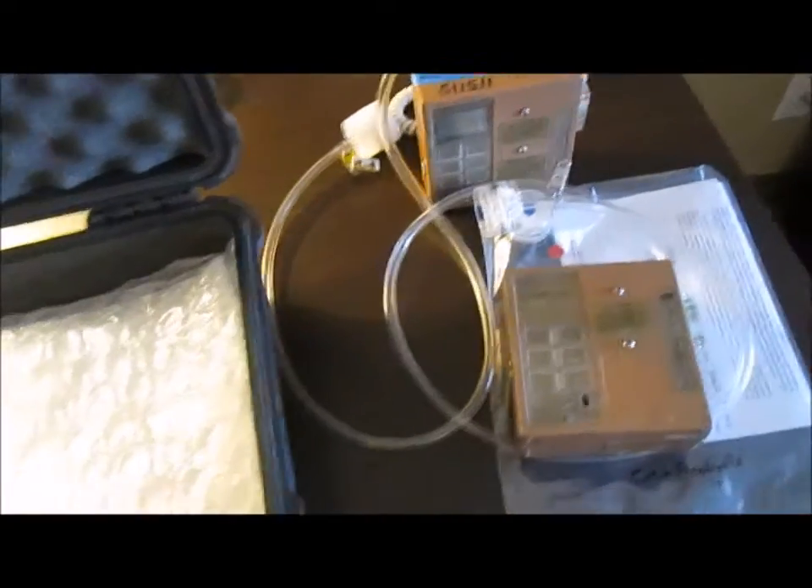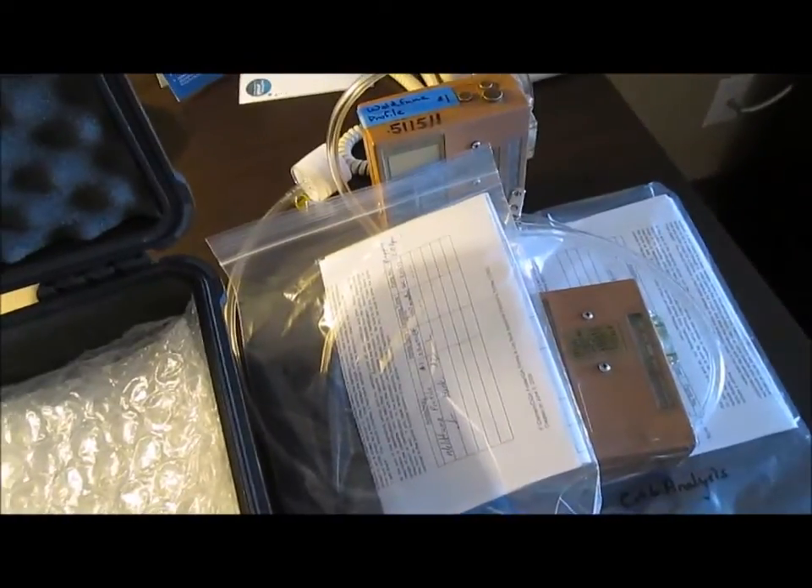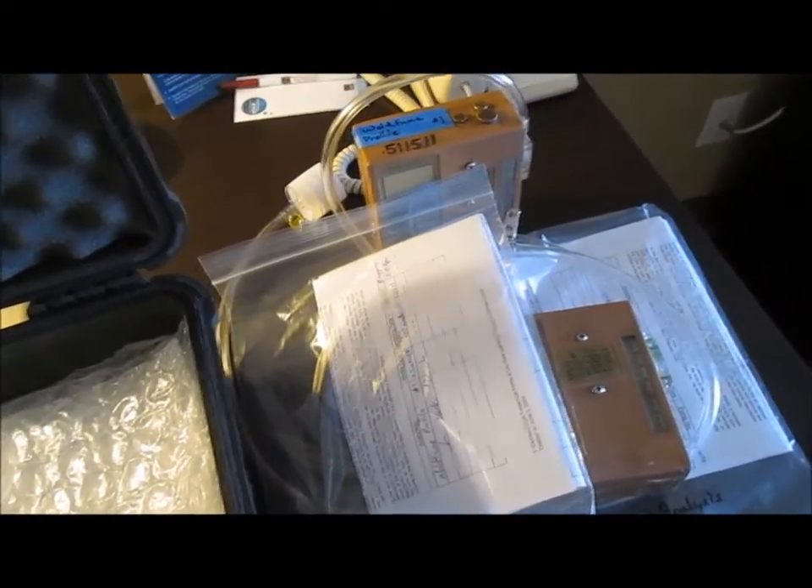This is essentially what the kits contain: the paperwork, which I'll be filling out, and then the pumps. I just take the test and run it for 8 hours. Thank you.